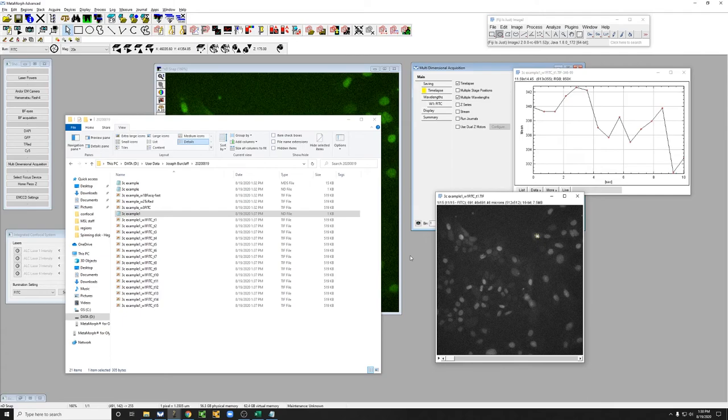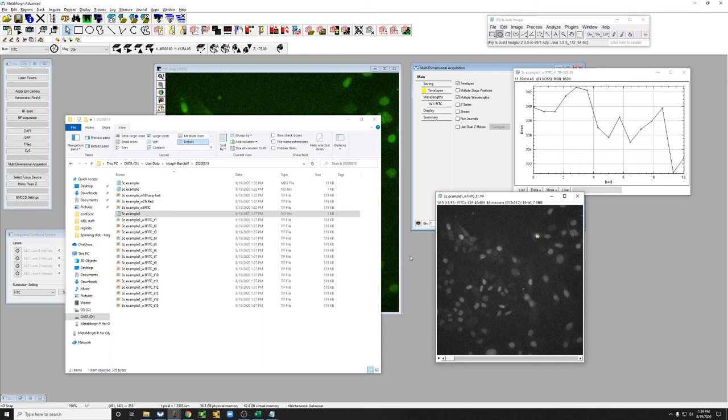The way it works is it uses an infrared beam to find the position of the cover slip and then it has a mechanism that keeps the position of the cover slip relative to the objective constant during the experiment.